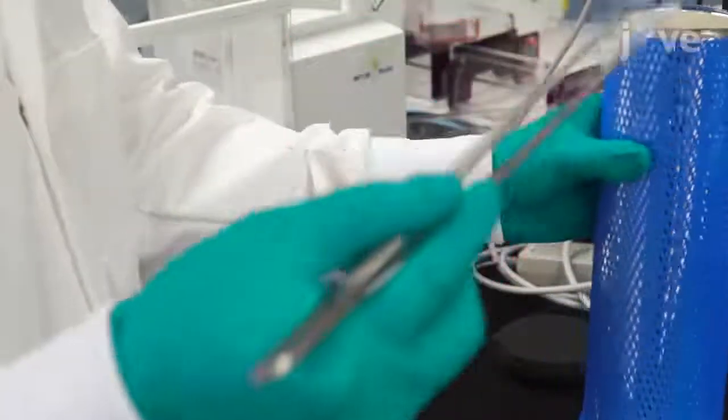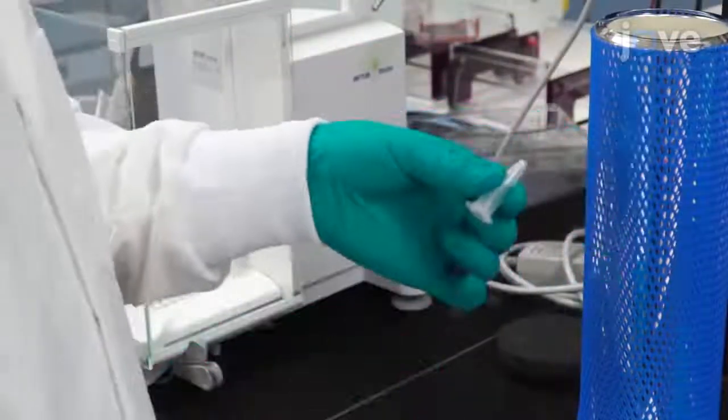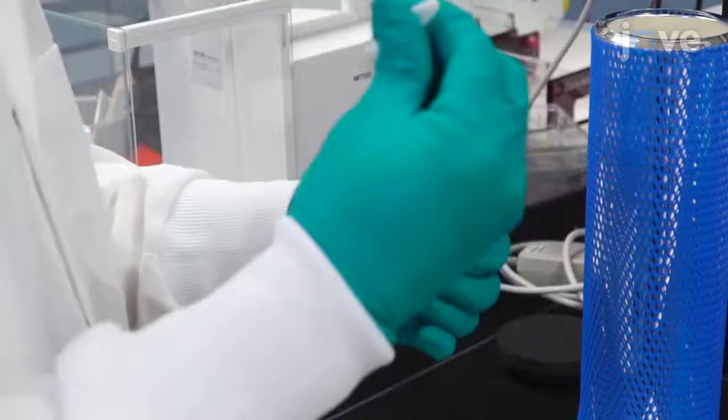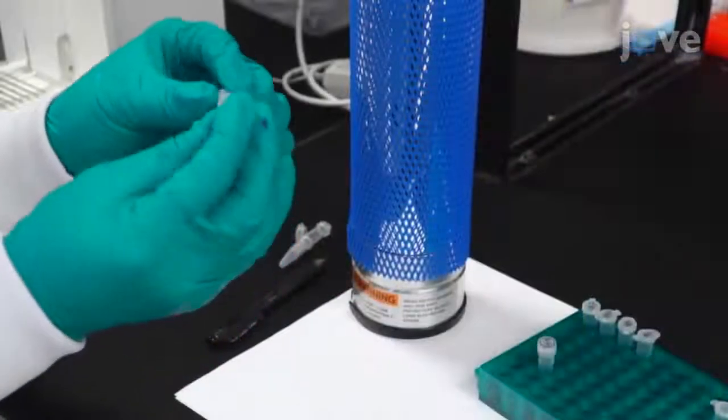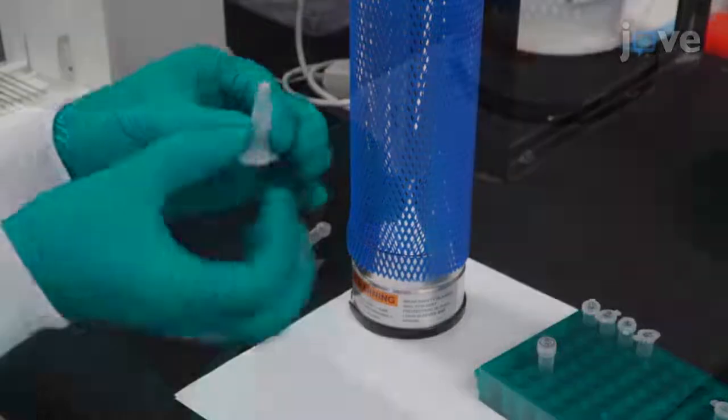Use long forceps to remove the 1.5-milliliter sample tube from the liquid nitrogen dewar. Wearing nitrile gloves, grab the frozen tube, invert it, and sharply pound the tube lid.